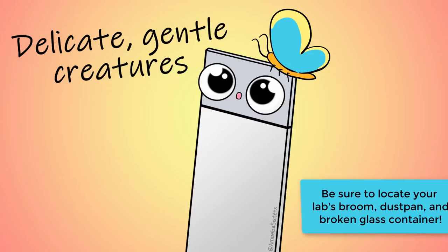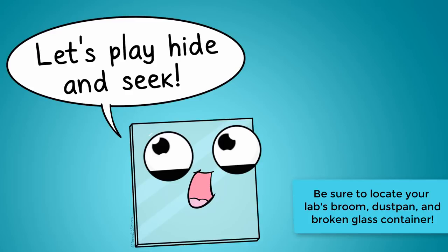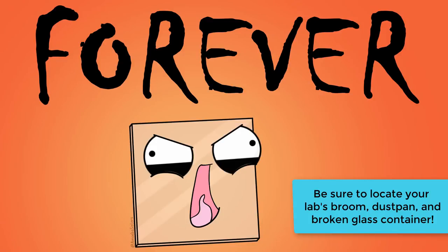Now, 3 additional tips about using microscopes that I just want to mention. Number 1, most microscope slides are glass, so they can break if dropped. And if using cover slips, keep in mind they are extremely easy to lose if not careful.